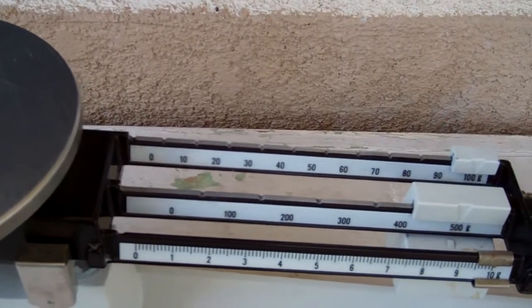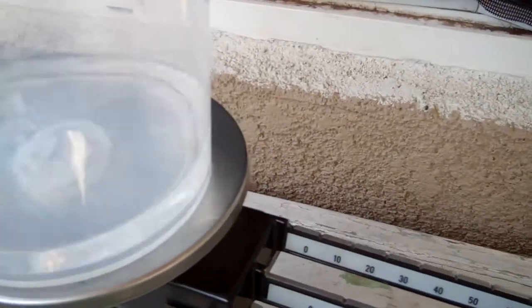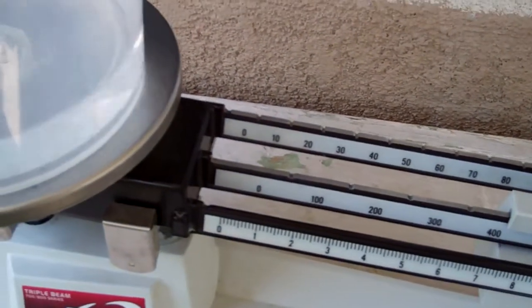That means this object weighs more than that. So using a triple beam balance, probably not a good idea. You probably need something like maybe a digital scale or something.